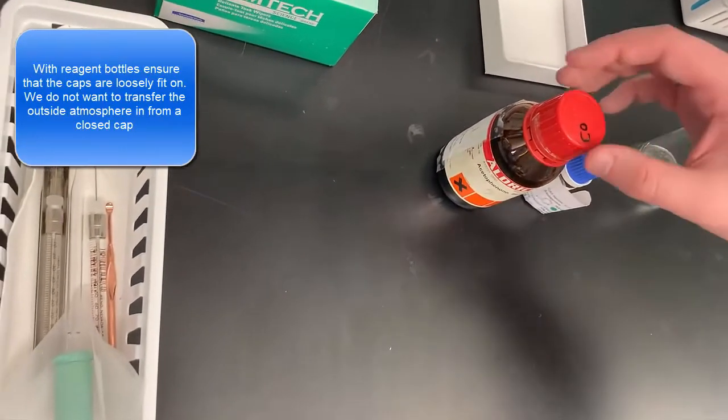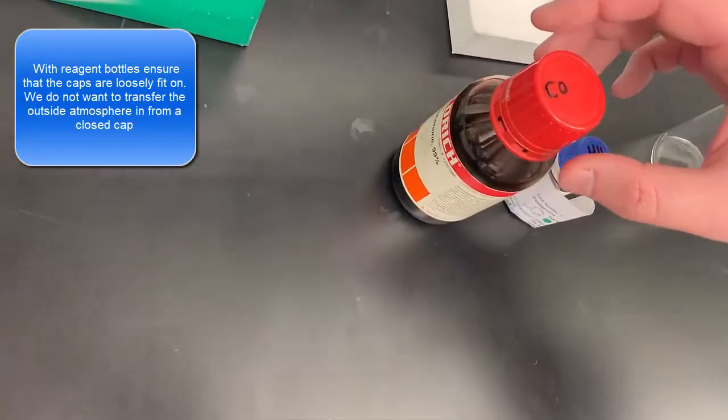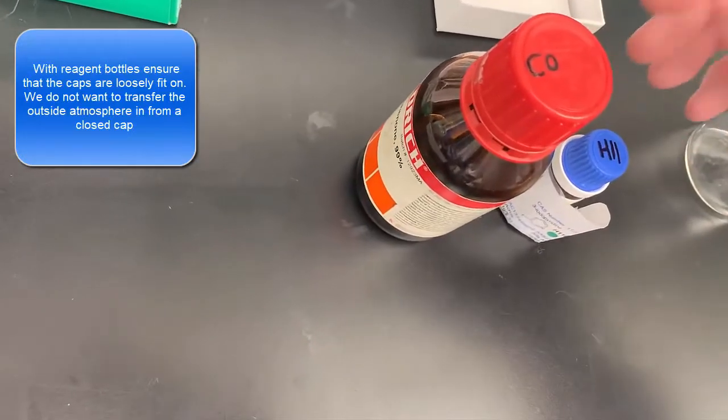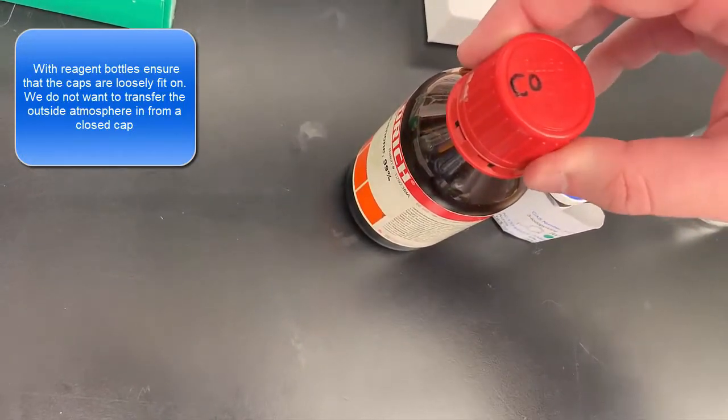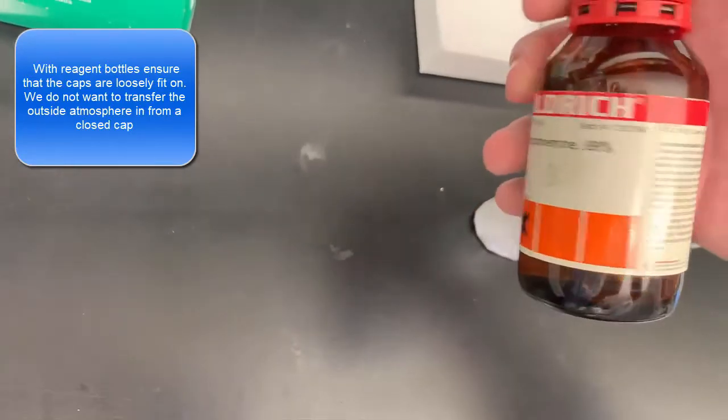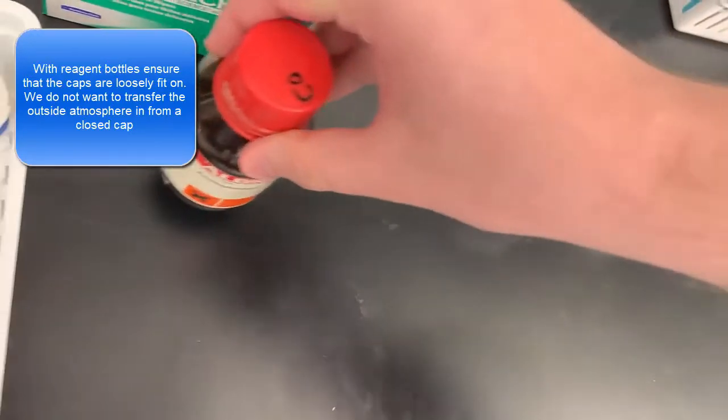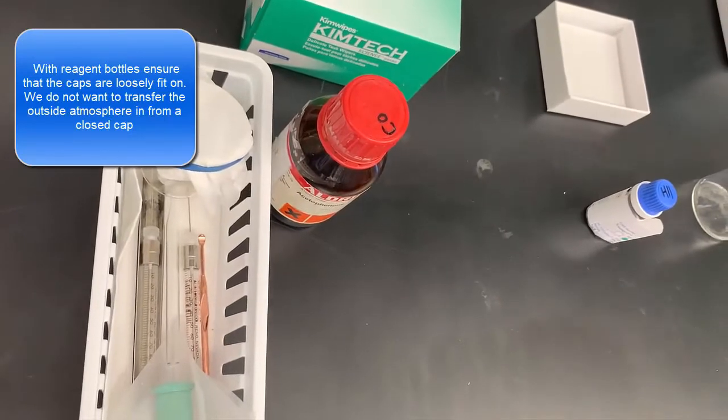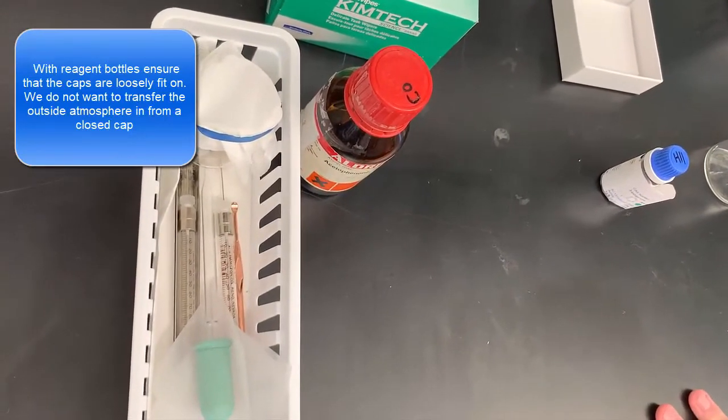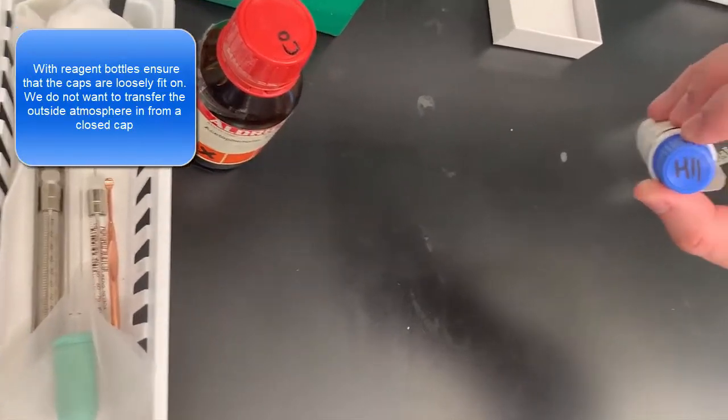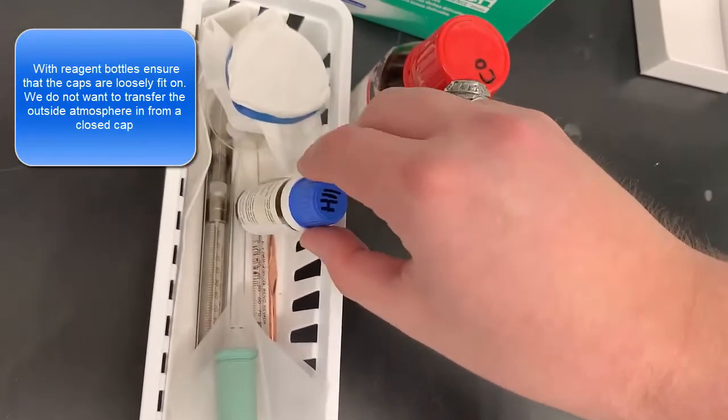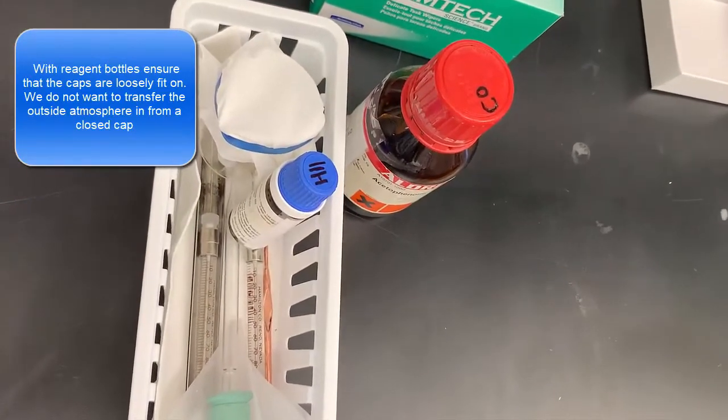Finally, if you have any reagents you need to bring into the glove box that are not already inside, you will need to bring those in with you as well. If they're very large, like this large bottle of C0, you can leave it outside of your bin and put it in after the bin is done. If it's something small, like this bottle of H11, you can place that inside your bin with everything else.